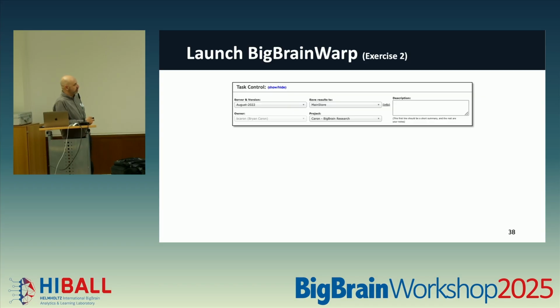What I would like you to do, though, and when you're organizing again by project, it might give you your default personal project that you saw, HB09 or 10 or whatever, but switch it to the project that you created, right? Because you're going to keep your work organized into different categories depending on the activity you're working on.